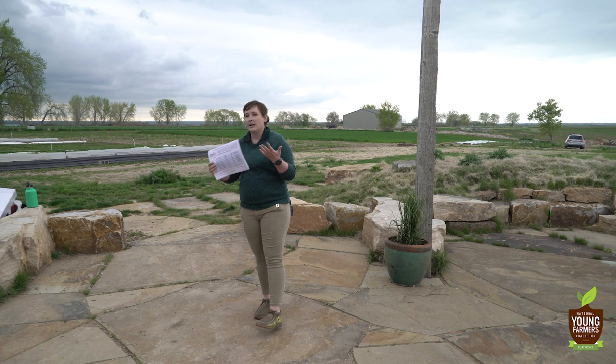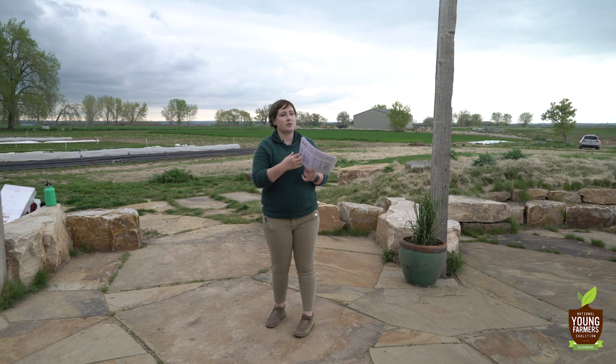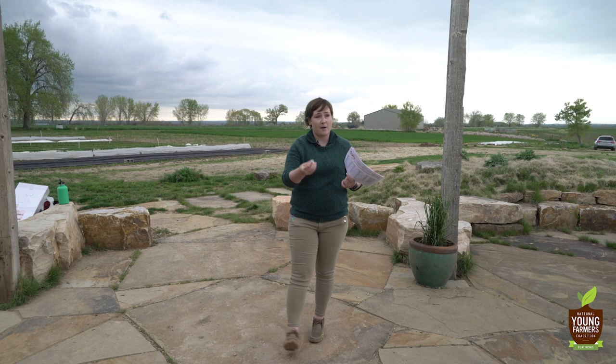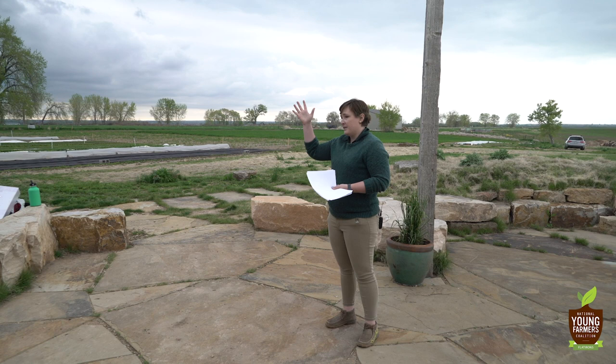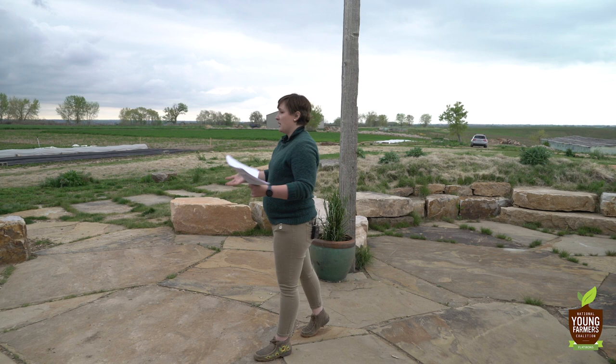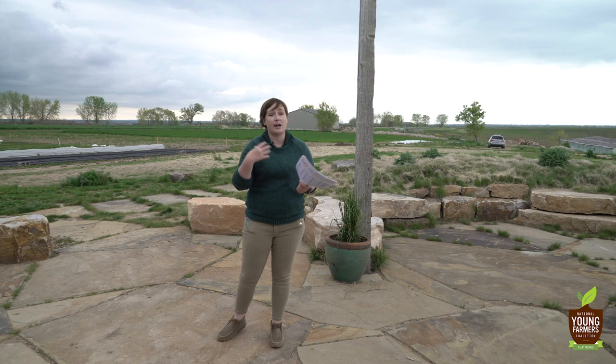When we do the Haney test or a traditional soil test, we're doing an extraction method. So we're isolating just that one nutrient, pulling it out of our soil, and measuring how much is there. We know that we can isolate the plant available compounds, and that tells us I have this many pounds of phosphorus that my plant can take up this year. The TDN test is meant to be a more holistic picture of how much is actually there in all forms. We're learning a lot about carbon cycling, nitrogen cycling, and phosphorus cycling.